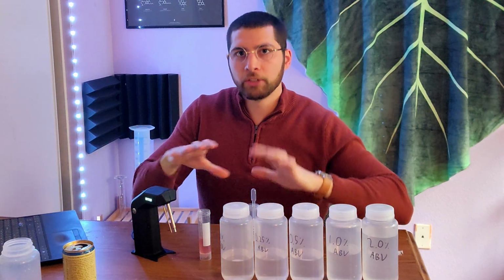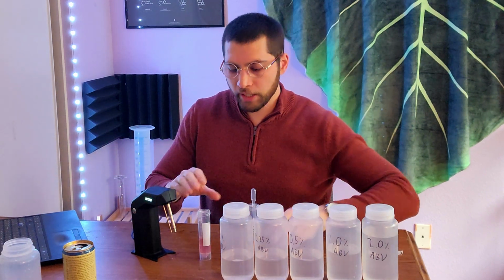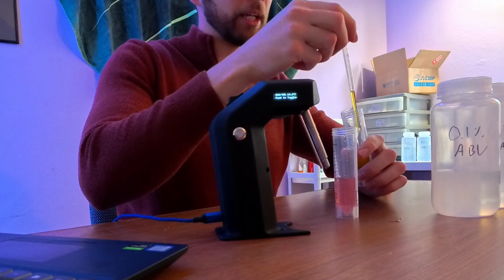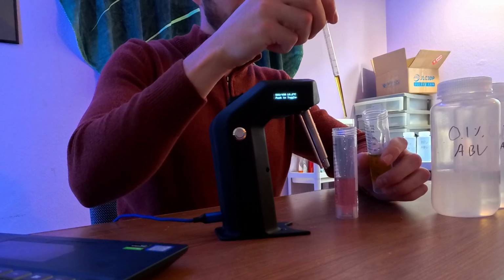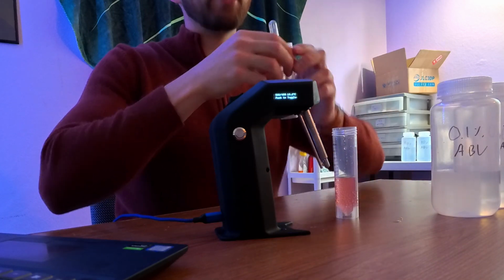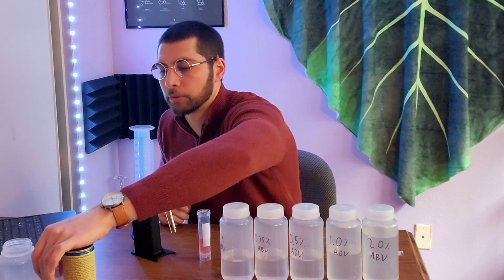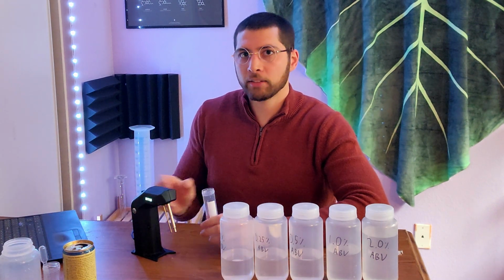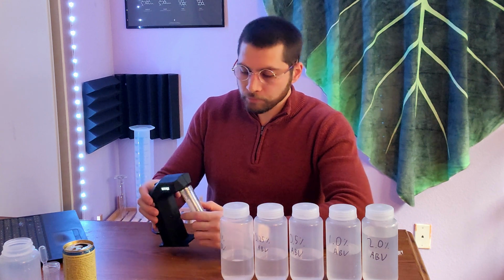To use this machine, you want all of your calibration samples and your kombucha to be at the same temperature. Higher temperatures, more alcohol will evaporate off. And so you need to make sure you're using the same temperature for all of your samples. And what I did there was just add a couple of drops of oil. I like to use vegetable oil.